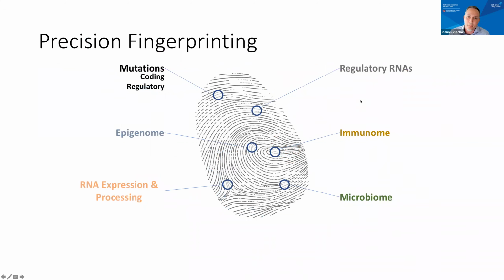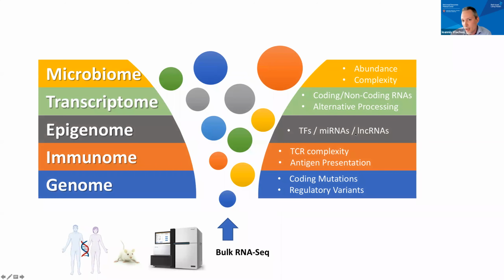In our translational research arm, we usually develop technologies that integrate multiple components for precision medicine applications. I will move very quickly. We really love bulk sequencing. It has been a major workhorse since 2011. Now, 10 years later in 2021, apart from gene expression, it enables us to extract multiple layers of information: coding and non-coding genes, coding and non-coding variants, TCRs, BCRs, and now even RNA processing. We also have a paper under review, which I hope will go well, in collaboration with Rob Patro's group and Joe Paulson, for extracting the microbial component with high accuracy. So bulk sequencing is amazing.